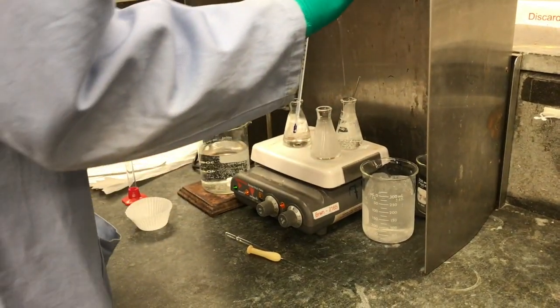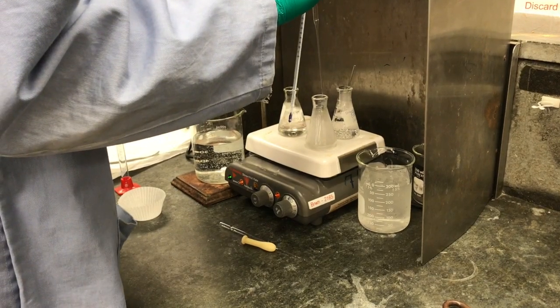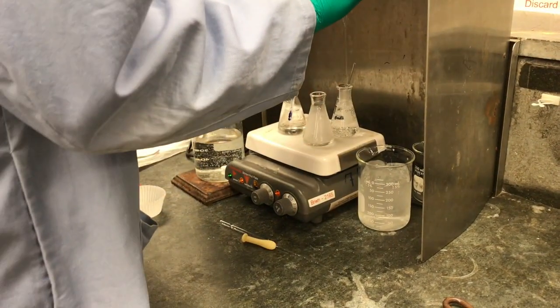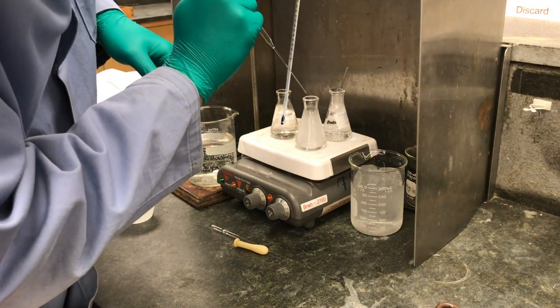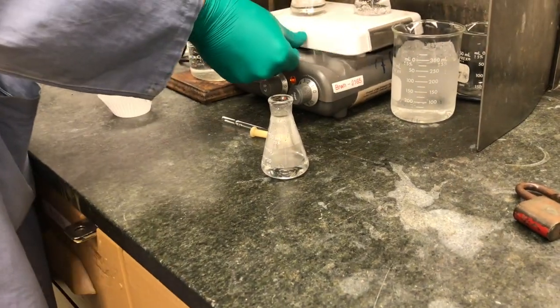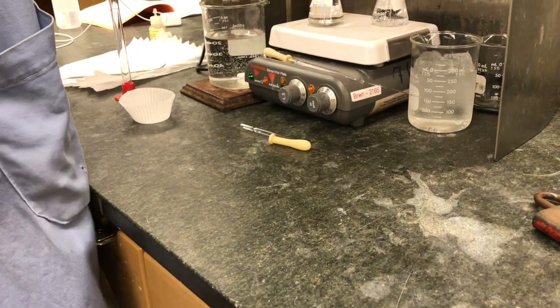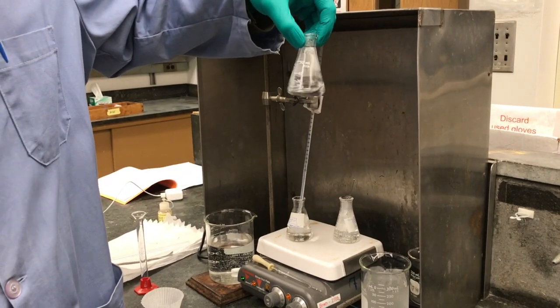So we're going to use approximately twice that in water. So I'm going to add a little slower just to make sure that we get that precipitation point. So we've added approximately 2 milliliters of our ethanol and approximately 10 milliliters of water. So that's quite a lot of water. So we're going to try to recrystallize this out.